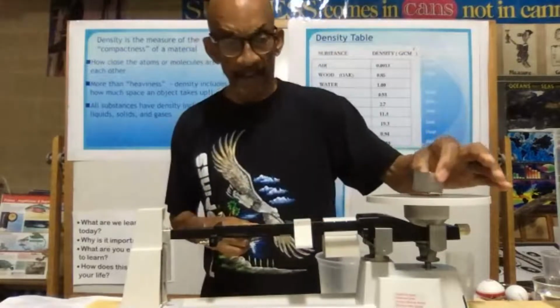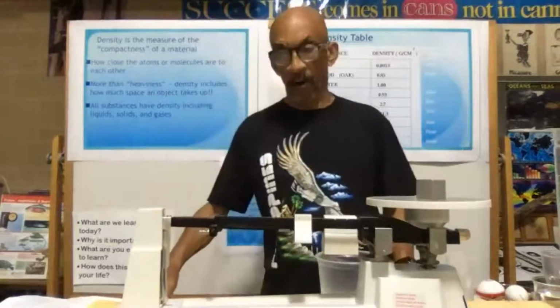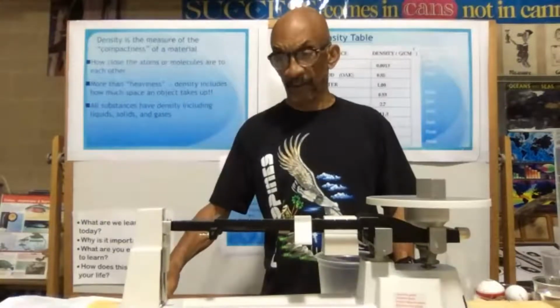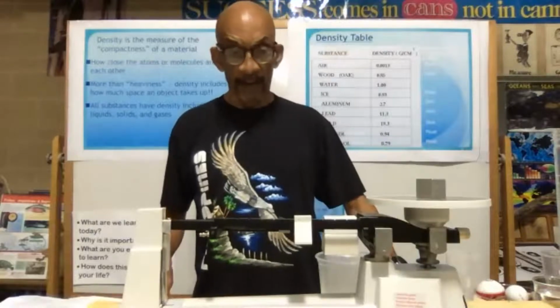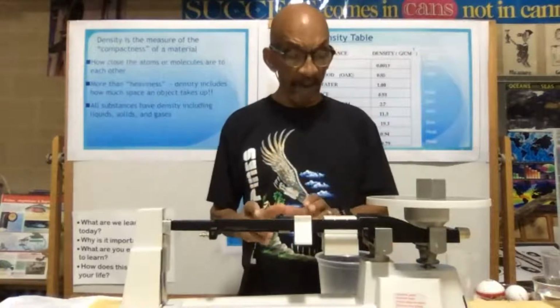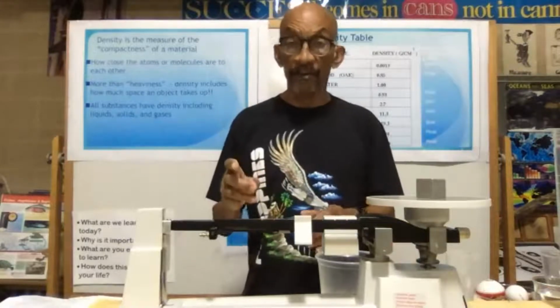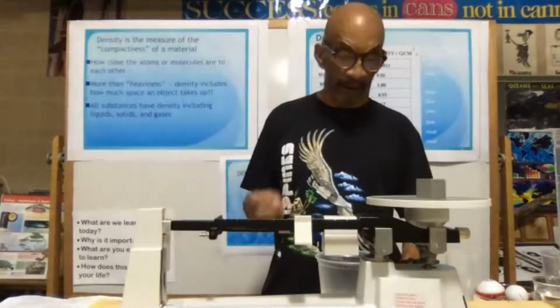And I'm going to put that on there, and we're going to see where it's at. I already kind of have an idea where it's going to fall. I'll just fine tune it. And I will tell you right now, it has a mass of 45.4 grams. Now, when we're talking about mass, usually they use the unit of measurement that we call grams.